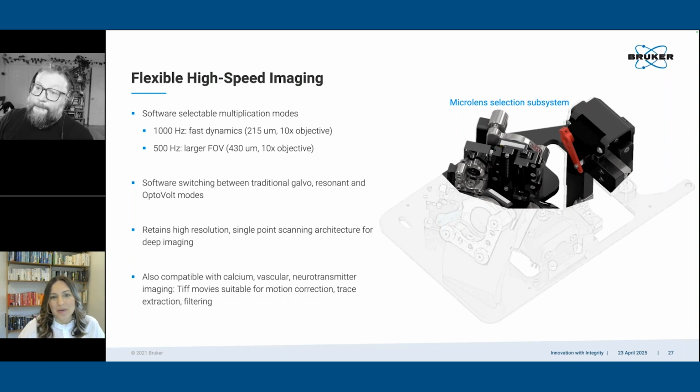While we're on the topic of going maybe outside of the in vivo neuroscience imaging that so many of us in this community think about, what about imaging organoids on a two-photon system? Is that a possible application for the technology? Yeah, we do have a couple labs that do organoid imaging. Organoids are also pretty dense, so 2P imaging is pretty good for getting through tissue, even with organoids.